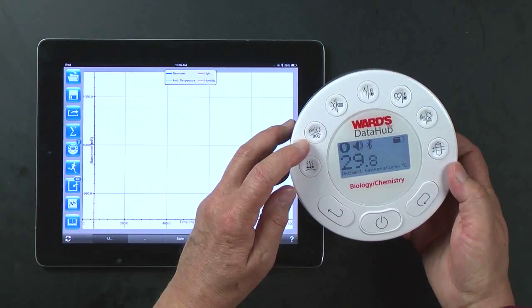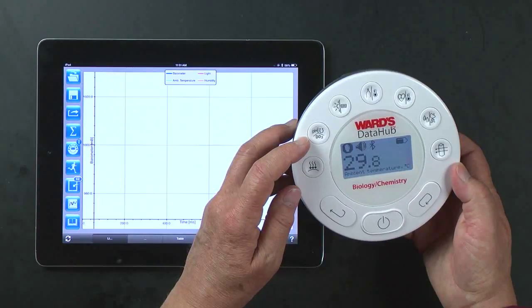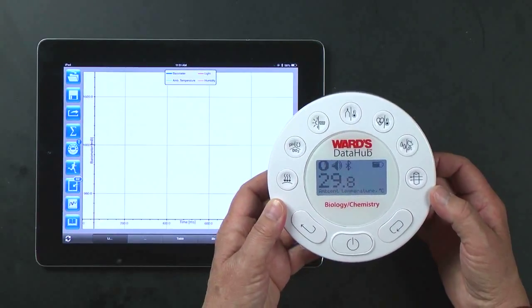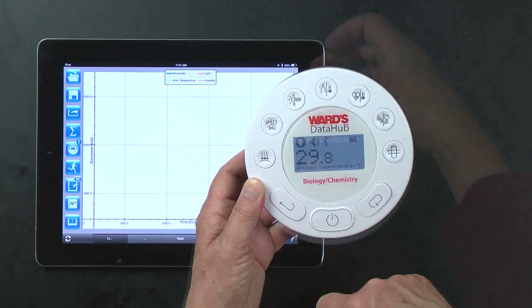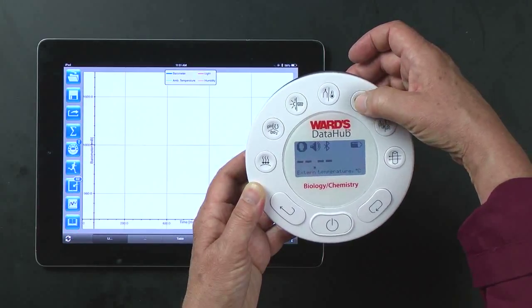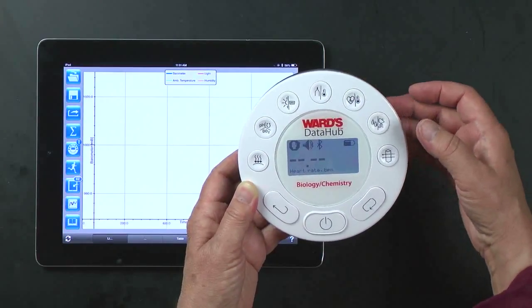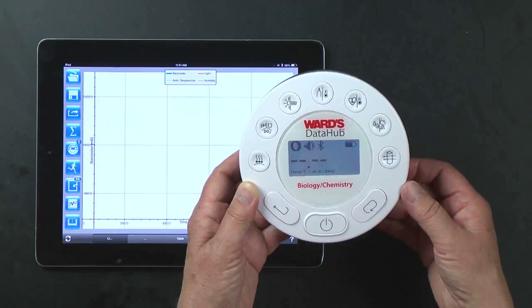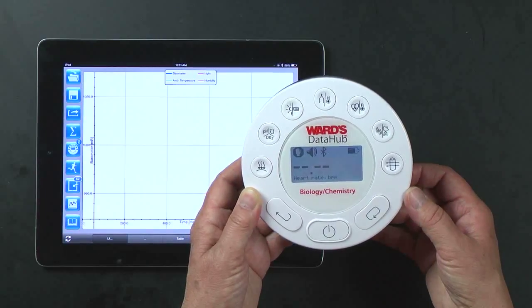So depending on which one it's saying on the little screen, the screen tells us what it is. This one says ambient temperature. If I want to change it, I can just click this, pick this one. This one says external temperature, and it says heart rate. So it actually does 2 different measurements. If they're on the same button, you can't really measure it at the same time.